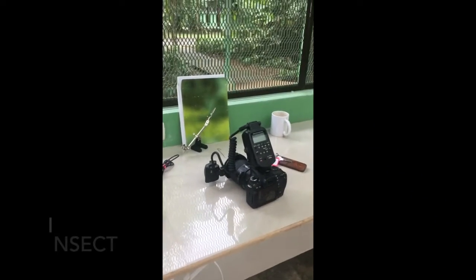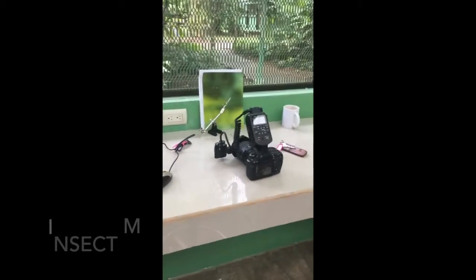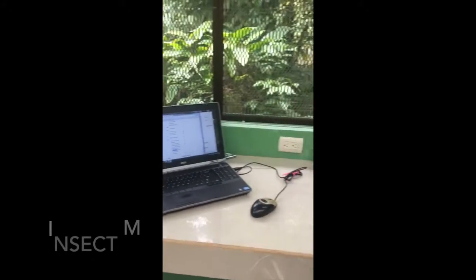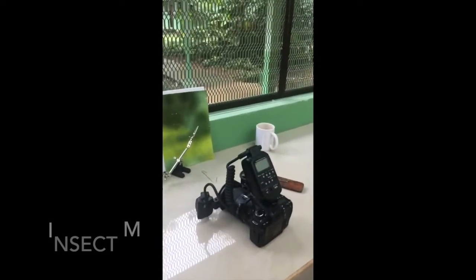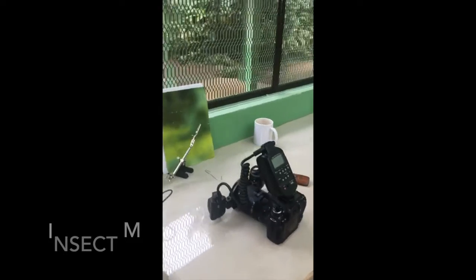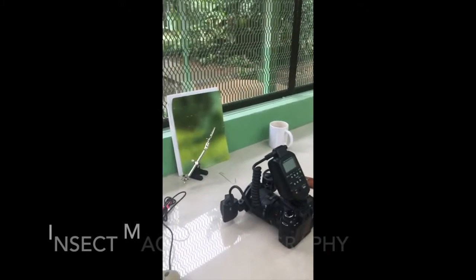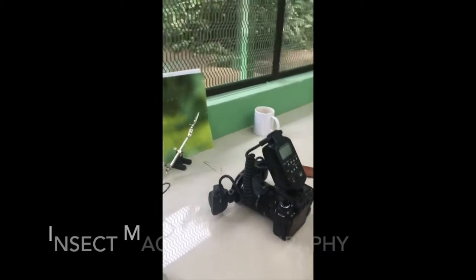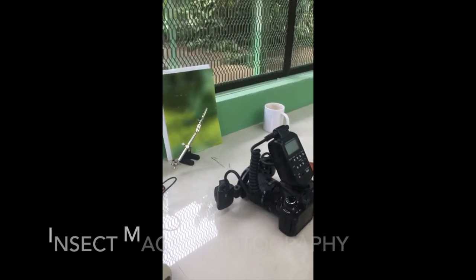Okay, so this is the next stage of the process. I had spoken to you guys in the last lab note that they've been entered into the database, into the computer, and once we give them an identity, we can start taking photos of them, to provide a digital record. I'll explain the materials I have laid out here for you and explain why digital records are important. And then I'll show an example of me taking a picture of one.